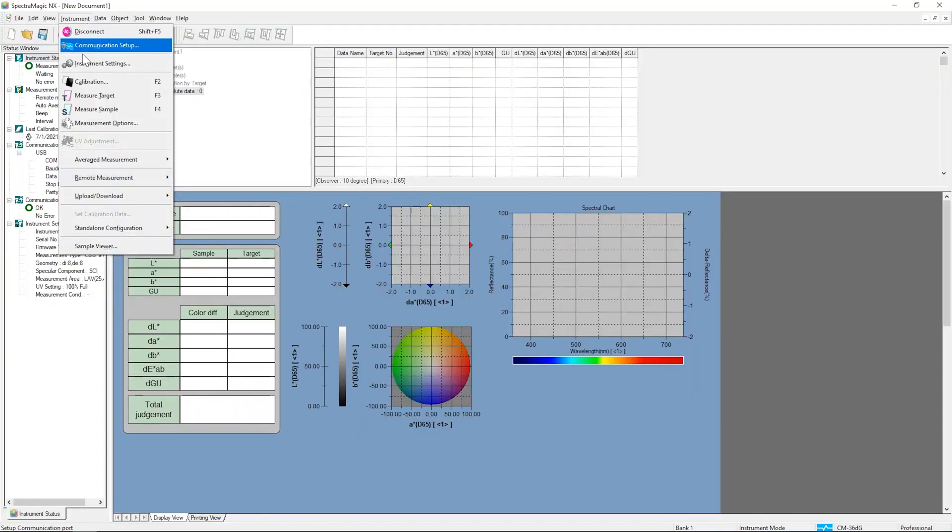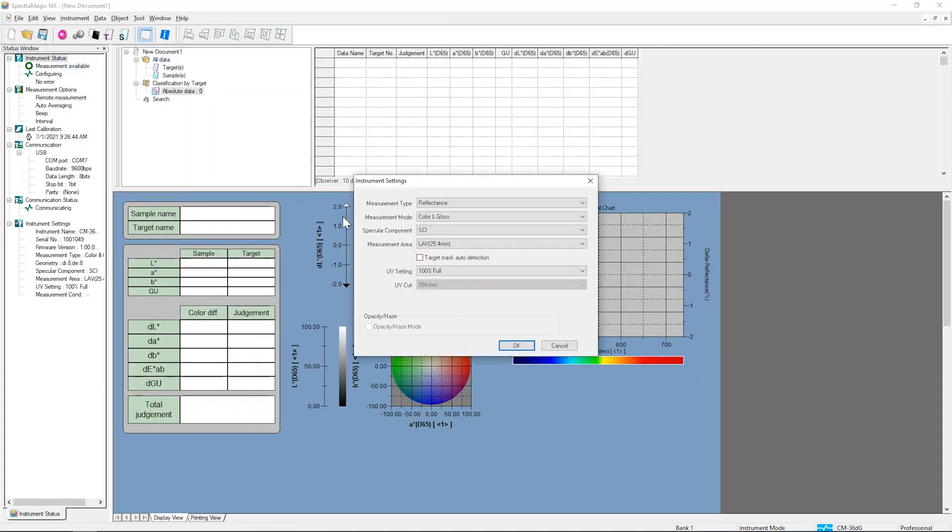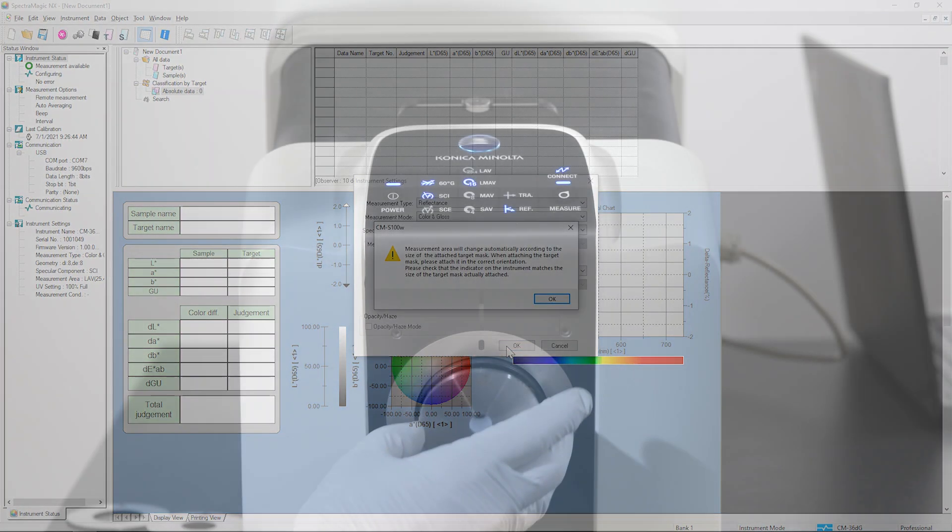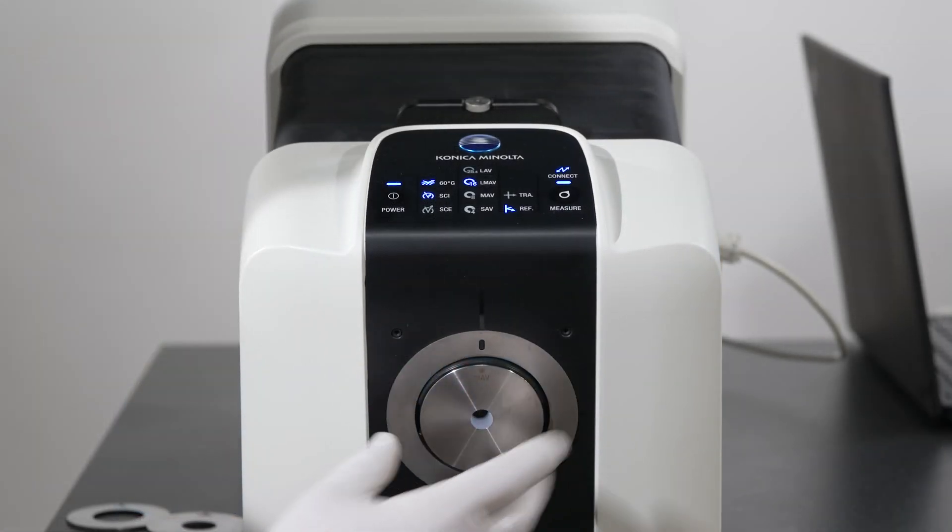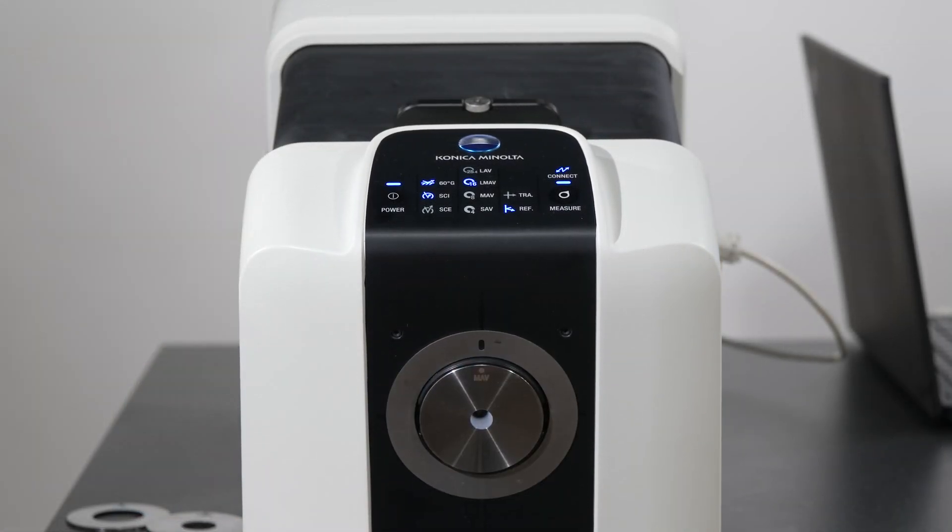You can also use the software to turn on the Target Mask Recognition option. When this is active, you can change the mask on the instrument and it will automatically update the mask indicator on the instrument's display.